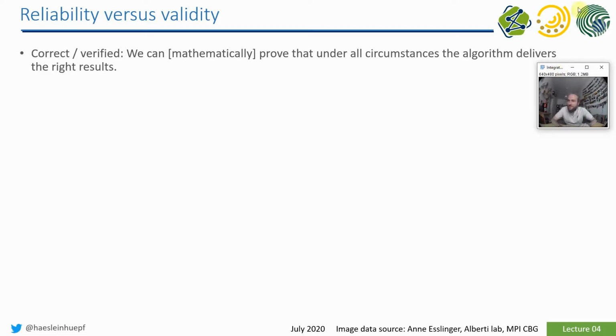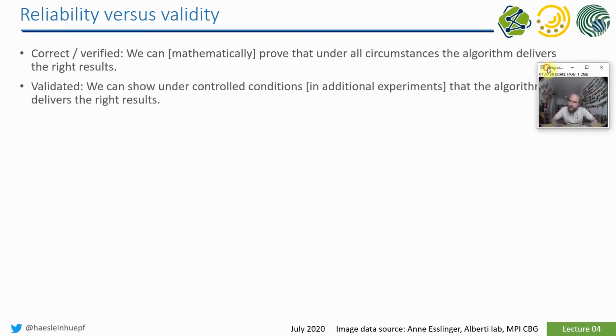So this is a technical approach, let's say. In computer vision and also in biology, you sometimes cannot do that because we are relying on a fuzzy biological thing which we have to manipulate manually in order to put it in a microscope, and we can then measure the size of it. So we do not know the size of this thing, and that's why we cannot prove in a mathematical sense that the size we measure with our image analysis workflow and with the microscope is really related to the actual size, because we don't know the actual size.